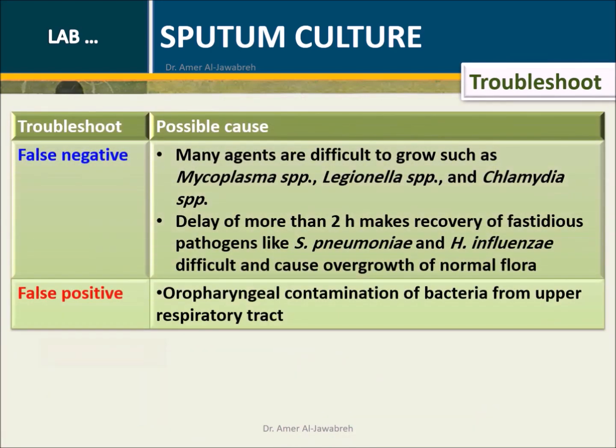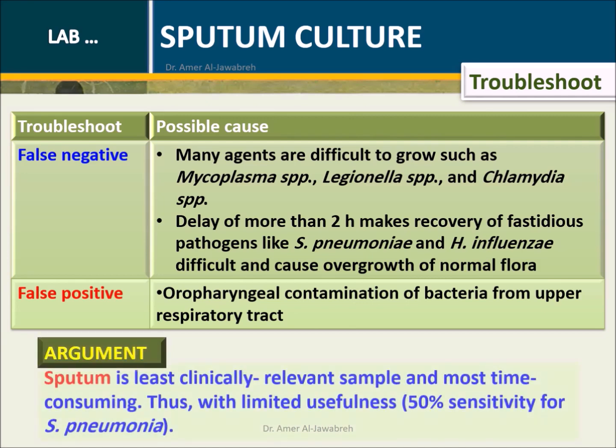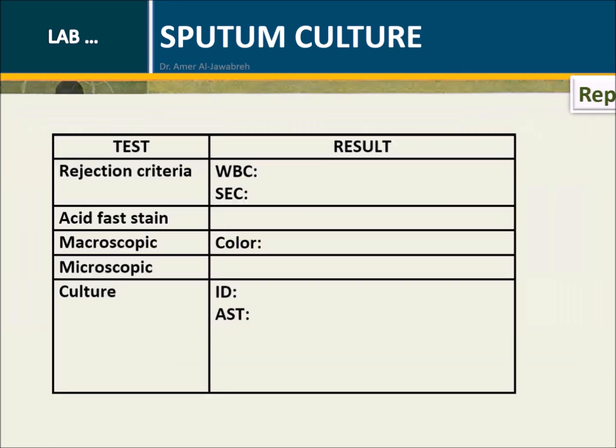Troubleshoot. Table showing troubleshoots and possible causes. Argument. Sputum is the least clinically relevant sample and most time consuming, thus with limited usefulness. Report. Use this table to report results.